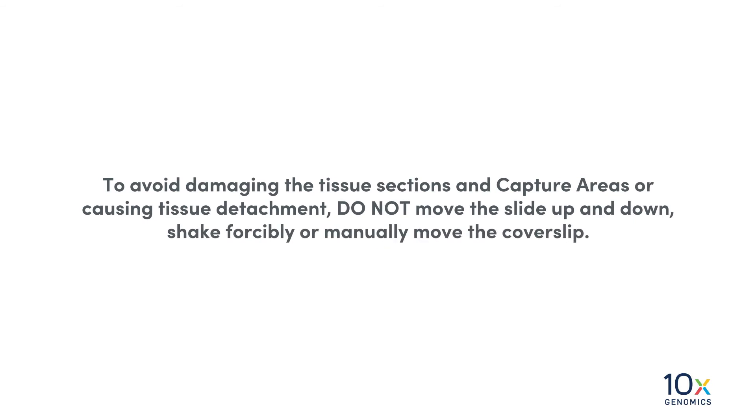To avoid damaging the tissue sections and capture areas or causing tissue detachment, do not move the slide up and down, shake forcibly, or manually move the cover slip.